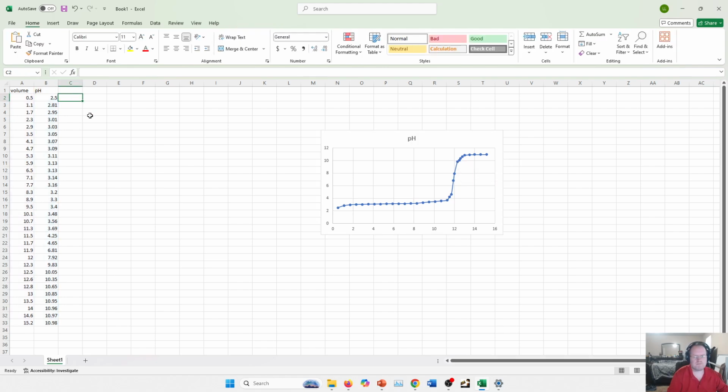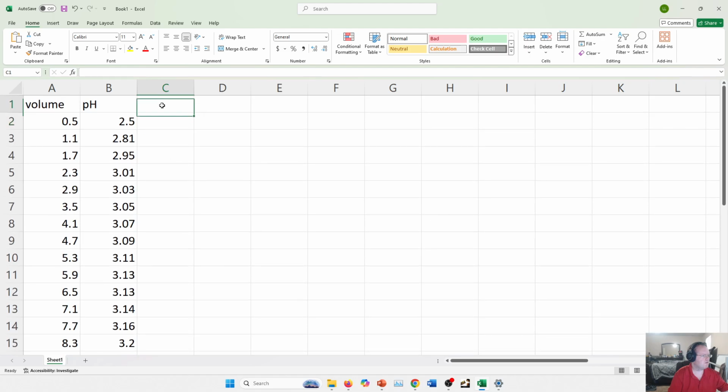So I'm going to go over here. Let me zoom in some more. So I'm going to do a first derivative. You don't have to label it exactly like that. Whatever works for you, keep track of it.